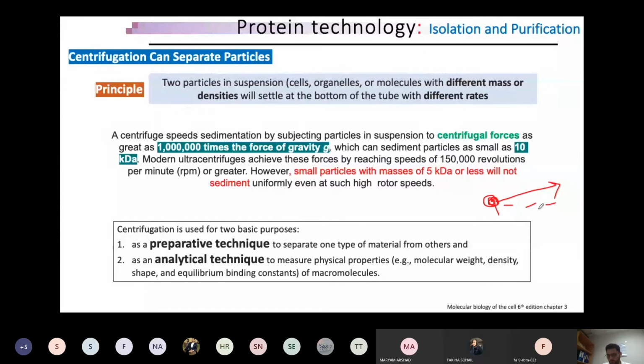So for example, these are three different molecules which will go to this centrifugal force. And as greater centrifugal force, as million times. So this is one. I mean, it's a huge number. Force of gravity. So this is not RPM only. This is gravity. So you think for a moment. What is G? G is one thing which pulls us to the surface, to the Earth, and 1 million times greater centrifugal force could be applied in a centrifuge machine to separate these things.